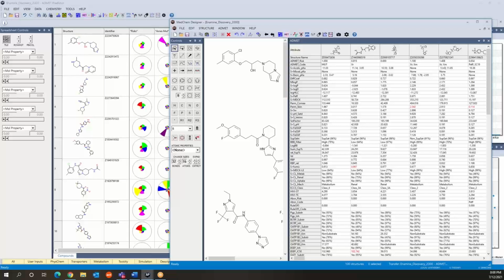So what I just did on 7 threads actually only used one license of each of the modules that were used as part of this calculation. That's through the graphical user interface, of course, but multi-threading also works in command line mode. So that is very useful as well. There will be a dedicated tutorial on the licensing aspects, so I don't want to go into too much depth here.